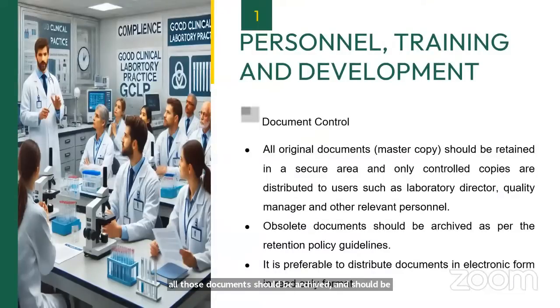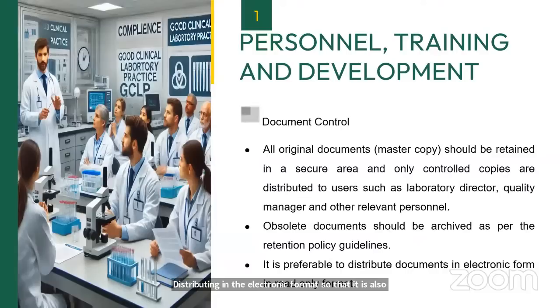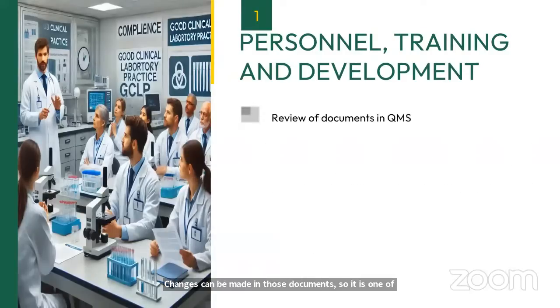The GCLP has one additional requirement. If you can find it, it is mentioned that it is preferable to distribute documents in electronic form in read-only format. So here a recommendation has been given by the GCLP guidelines that whatever documents are available in your laboratory, distribute them in the electronic format so that it is also environment friendly and user friendly. And you can make it in a read-only format so that no unauthorized changes can be made in those documents. So it is one of the requirements. If it is possible, you should be able to distribute those documents in the electronic format.